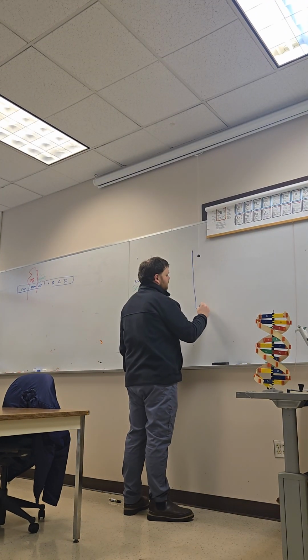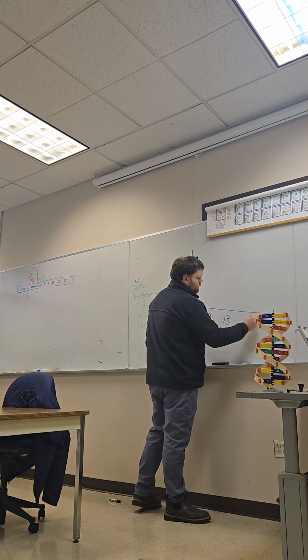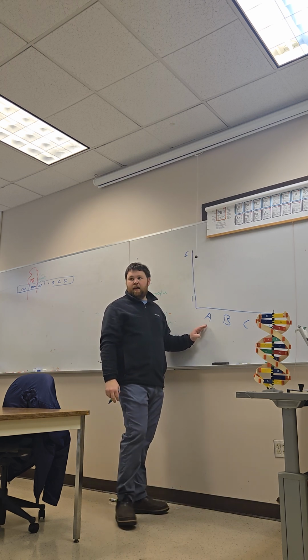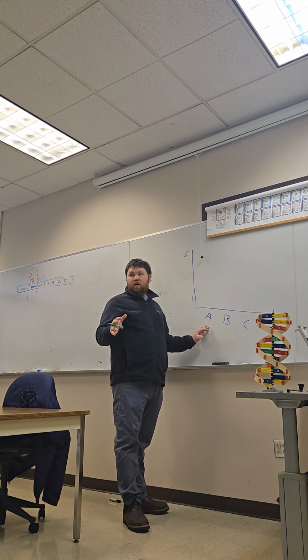Let's look at the data. We have A, B, C, D, and then just say 1 to 5. So that's our units, right? How yellow is A? Pretty yellow. Like a solid 5, or is it less than?